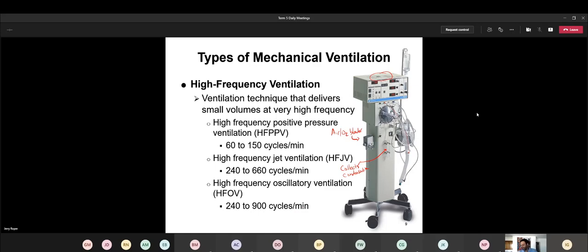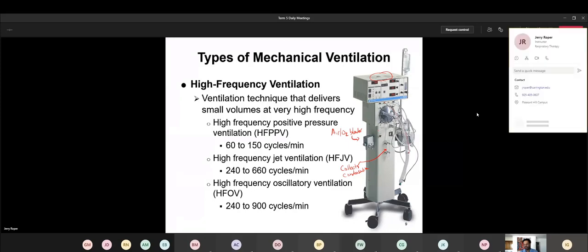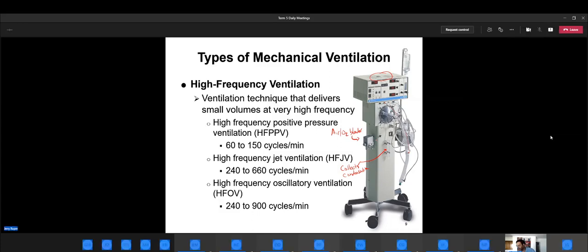And what else is going on with this machine? Just from the surface, just overall looking at it. By this little knob right here, I can tell exactly which model this is. They come in two different models. This company makes one called a 3100A and a 3100B. This has to be a 3100B because, no, this is a 3100A. I take that back. Because this little knob, we'll see it later, is what you're going to need to adjust to get everything to line up properly.